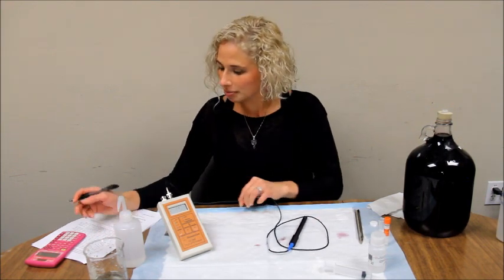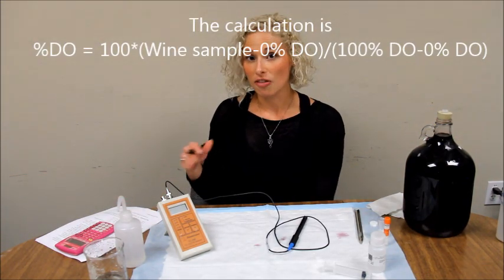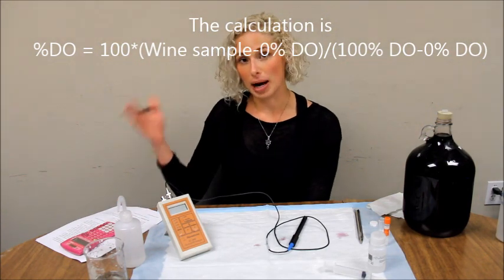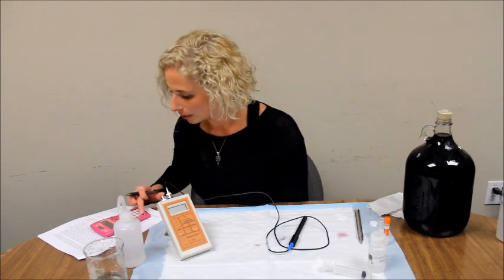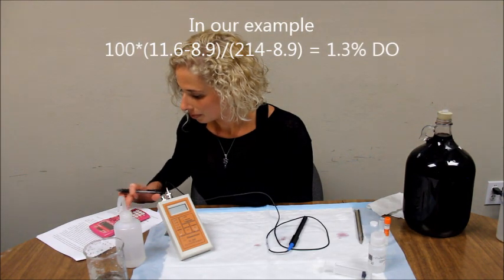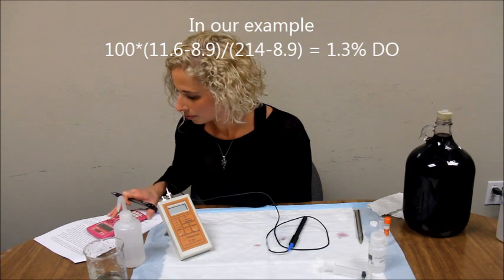You can turn off the instrument. Now, to do the calculation, simply subtract the 0% standard from the wine sample and the 100% sample. Then divide the wine sample number by the 100% standard number. Then multiply that value by 100. In this instance, our value would be 1.3% dissolved oxygen.